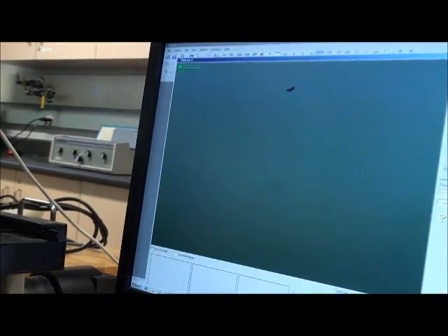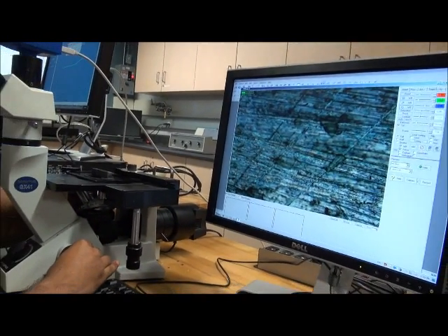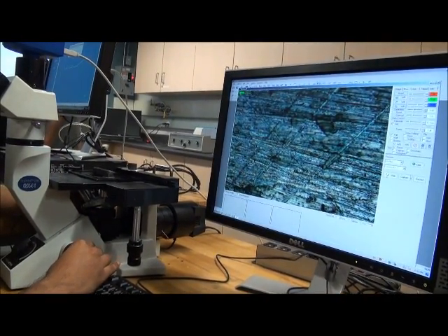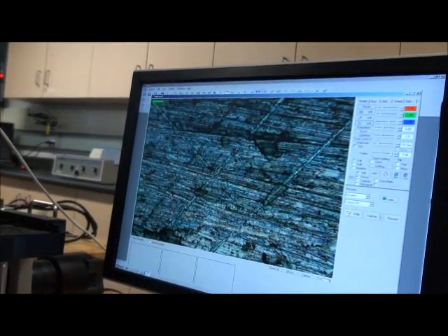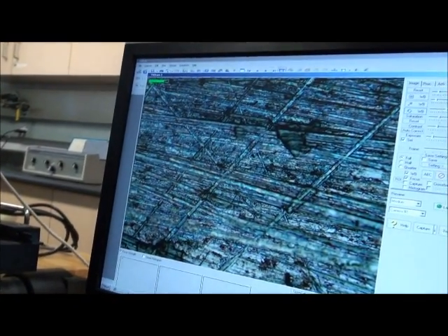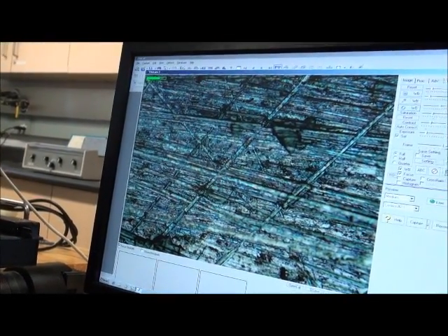Similarly, we can move for another 50x. As we can see, it shows a more clear picture and more details. So, we have to look which one we want.